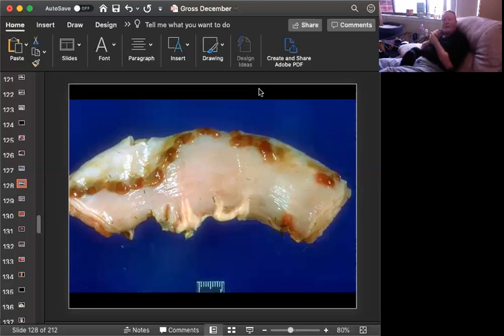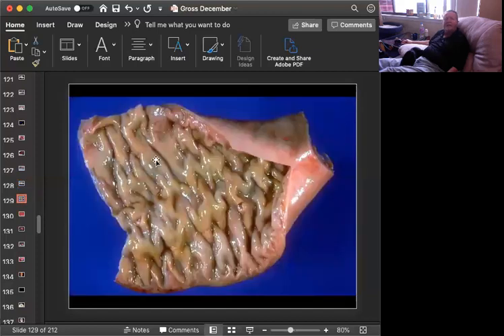the collagen. And I like that theory because so many of these animals that you still see it on are on great worming programs. And no one has ever been able to pull a migrating strongyle out of this. Strongylus vulgaris likes to migrate along the gut, but it does it on the inside. It does it in the mucosa, and it leaves little tiny tracts, but it doesn't cause this lesion. Hemomelasma ilei.